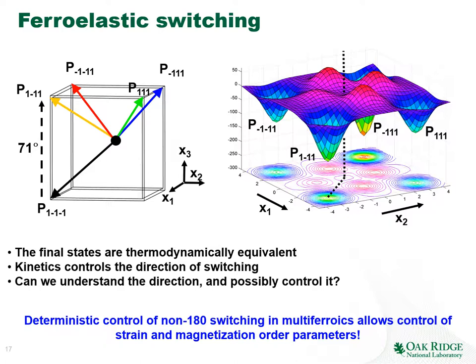So formally, from the point of view of thermodynamics, these four states are thermodynamically equivalent. They have the same energy. However, from the application point of view, they would be very different because we change the strain state of the material.